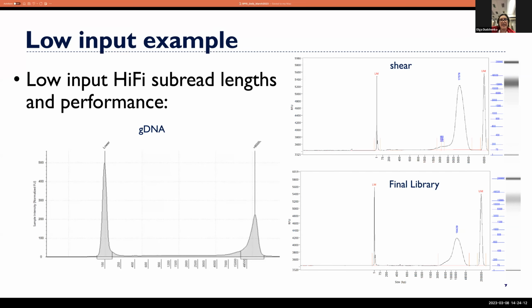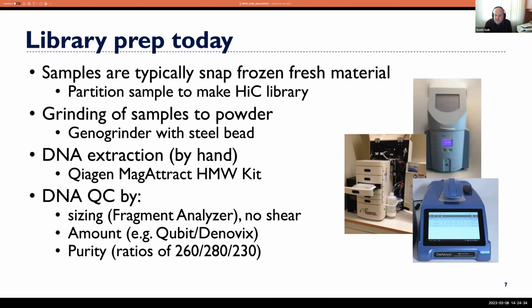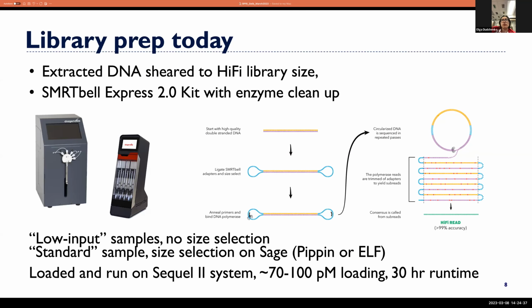Does SMRT sequencing do the same thing? There is a bias towards shorter pieces. In practice it has to be, but in addition to the fact that spots can be occupied by shorter things, is there some inherent systematic bias towards shorter fragments, like they amplify faster? Or they land faster, I think. So you will get a disproportionate bias towards shorter stuff, even if your library contains relatively long chains.